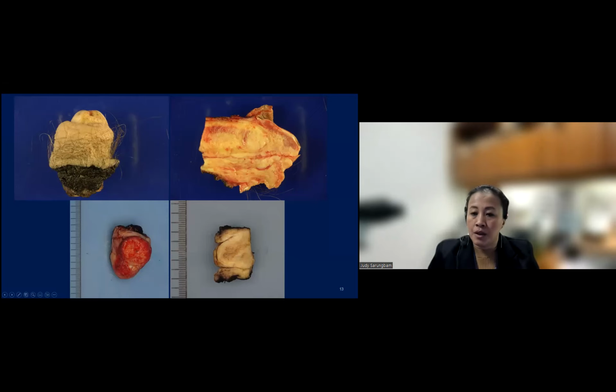You can leave the foreskin if it is bulky, because you can appreciate the relationship of the tumor to the foreskin. This is one half of the bisected penis, and you can see tumor involvement of the glans, the urethra, and even the corpus cavernosum. Once we have this, we can serially section into multiple smaller pieces and then submit entirely.